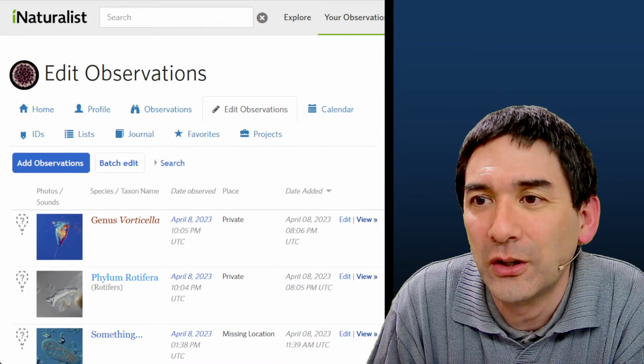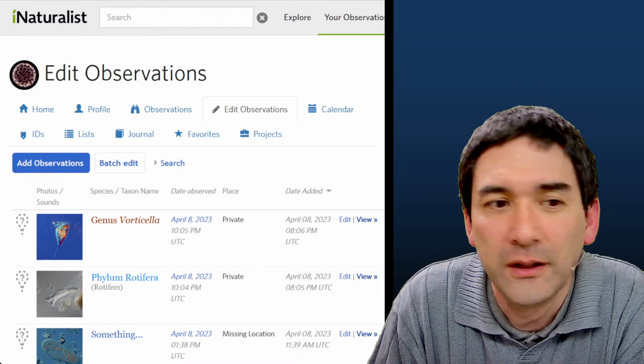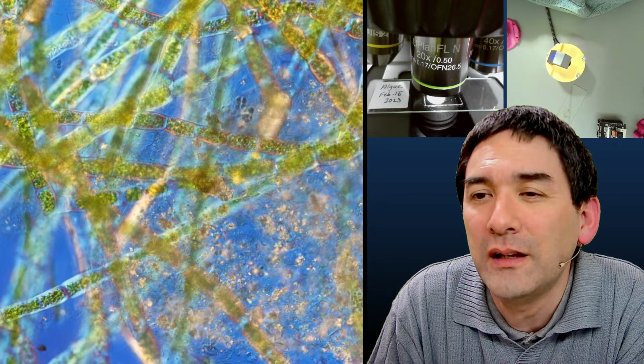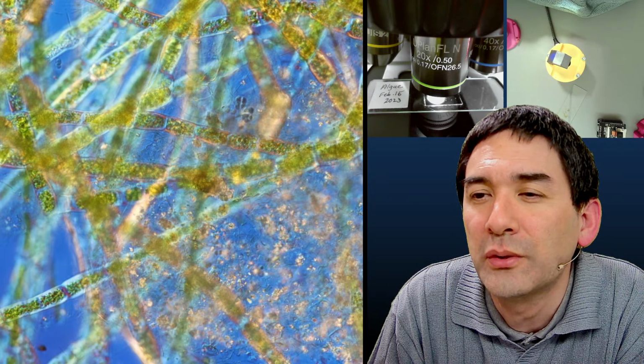Right. So what I'm going to do again is I'm going to go again into some of the, because microscope view is much nicer. Okay. So let's have a question. I have heard that copper acetate and copper sulfate could be used to immobilize ciliates. Do you know anything about this?